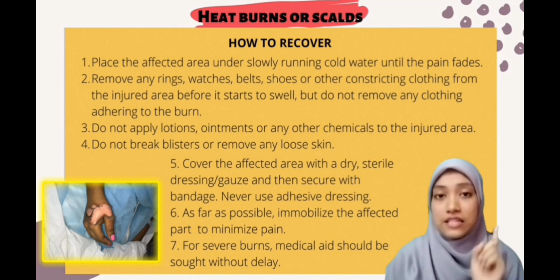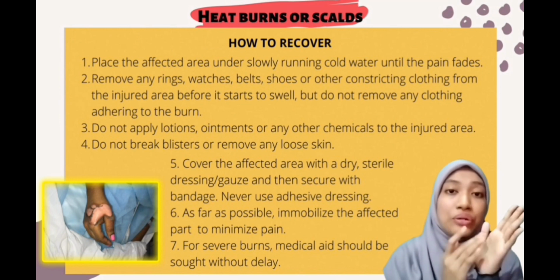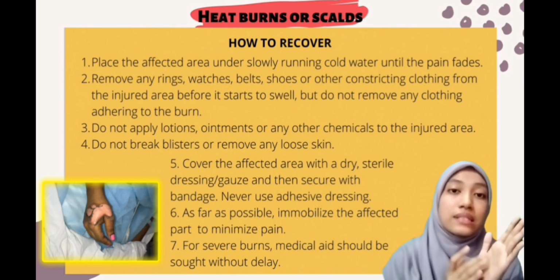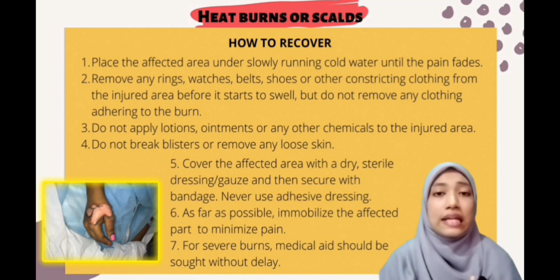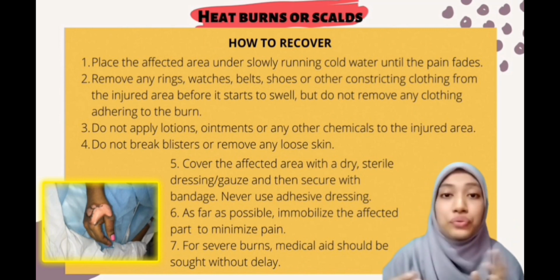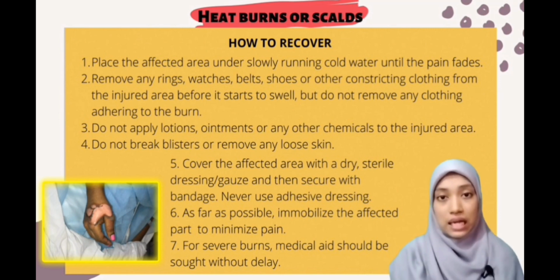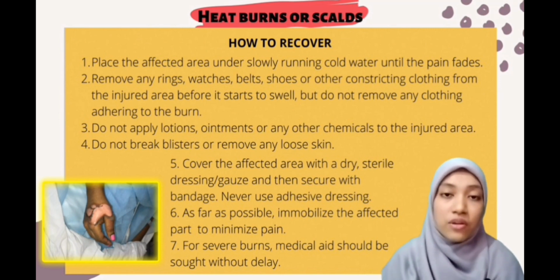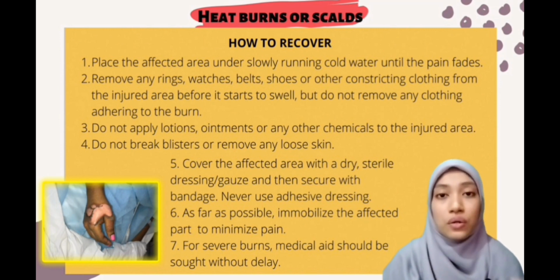Okay, first things first, place the affected area under slowly running cold water until the pain fades. Second, remove any watches, rings, belts, shoes or other constricting clothing from the injured area before it starts to swell. But do not remove any clothing adhering to the burn.